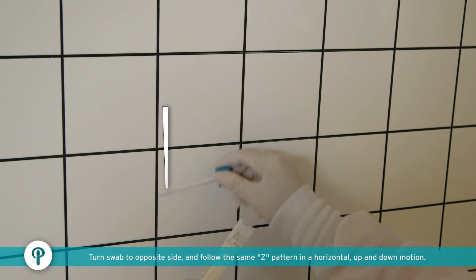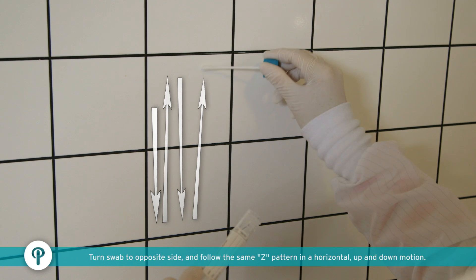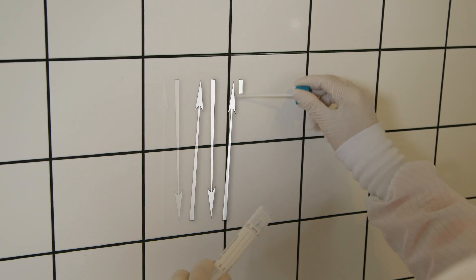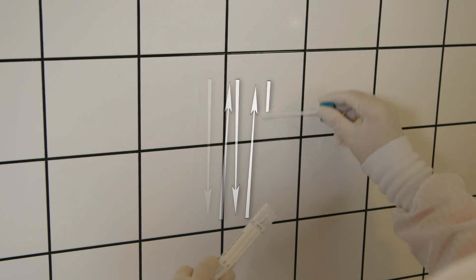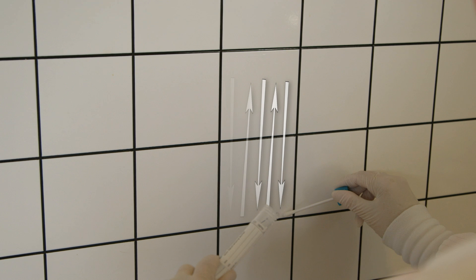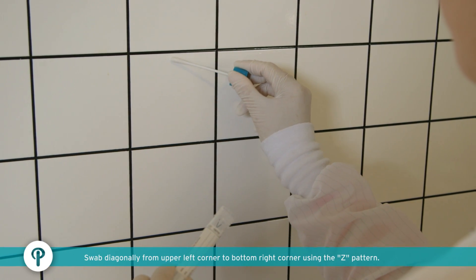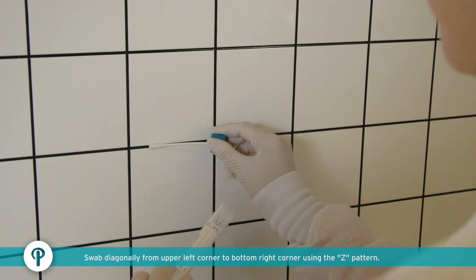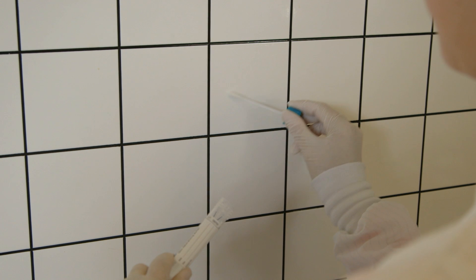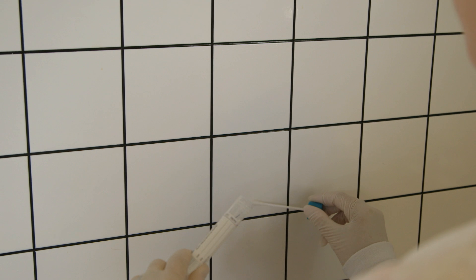Turn swab to the opposite side and swab approximately 10 times in a vertical, up-and-down motion over the surface area being sampled. Then swab diagonally using the same swab surface side as used in the vertical swabbing, starting in the top corner of the sample area and using the Z-pattern, swab approximately 10 times until the opposite bottom corner has been sampled.